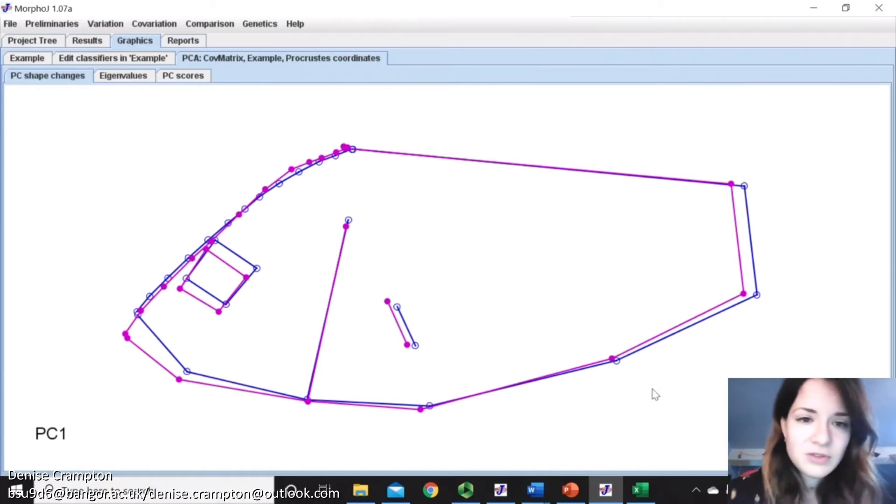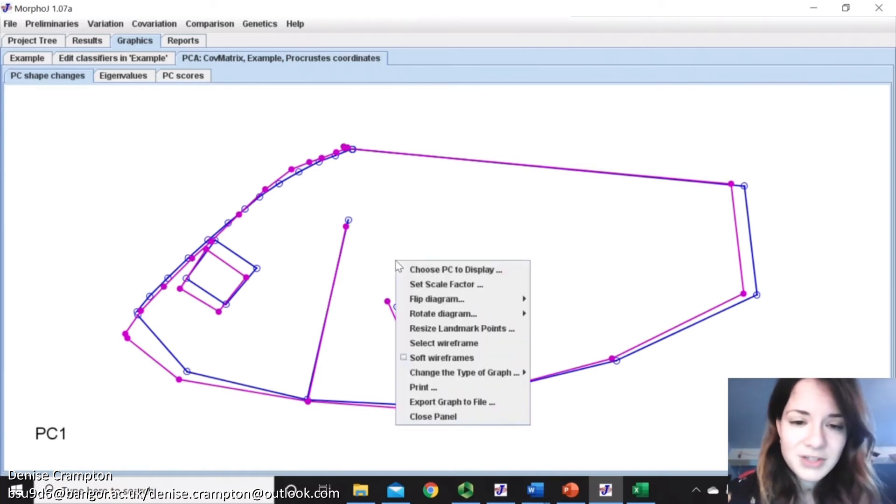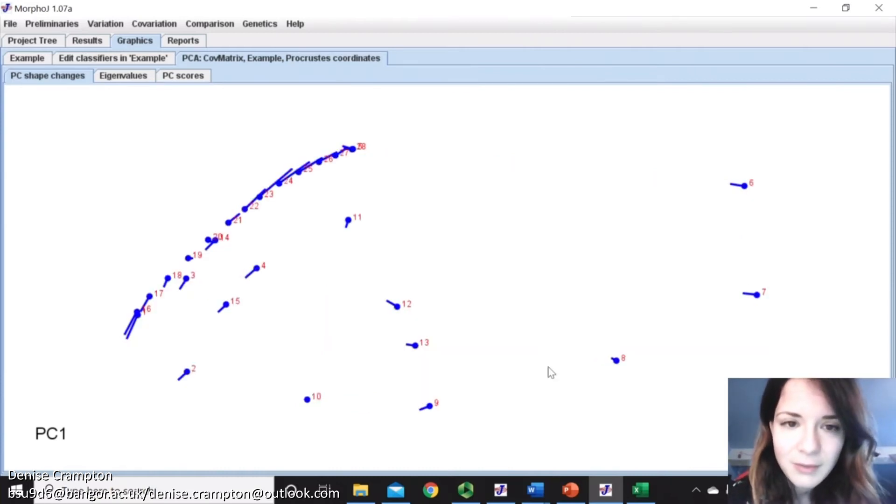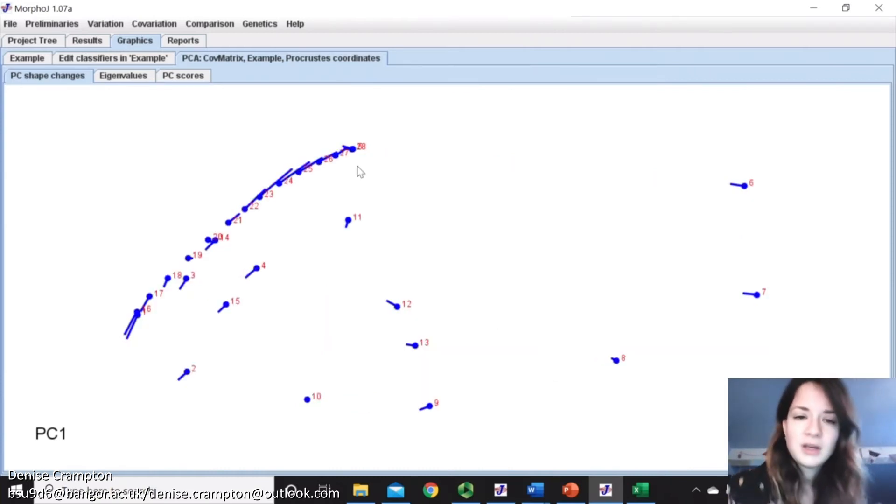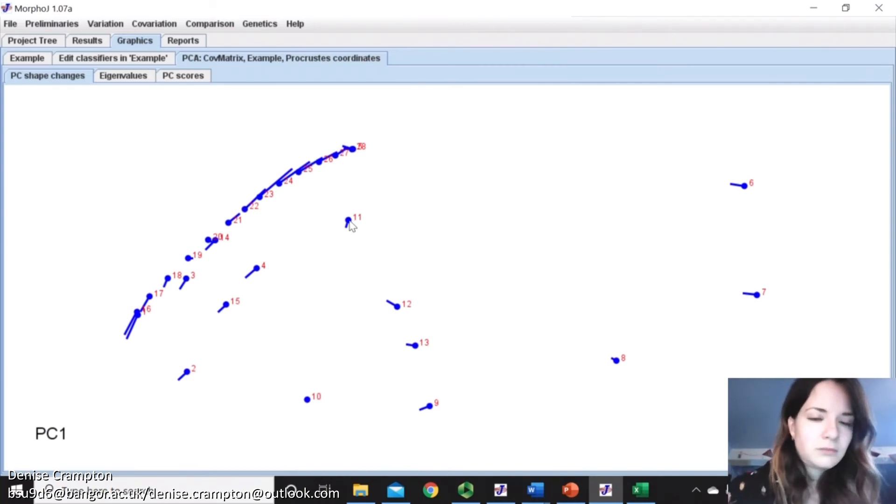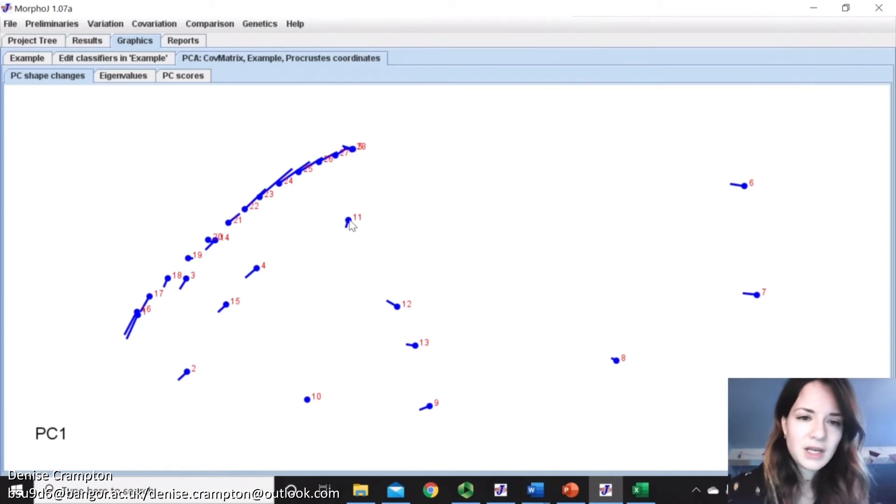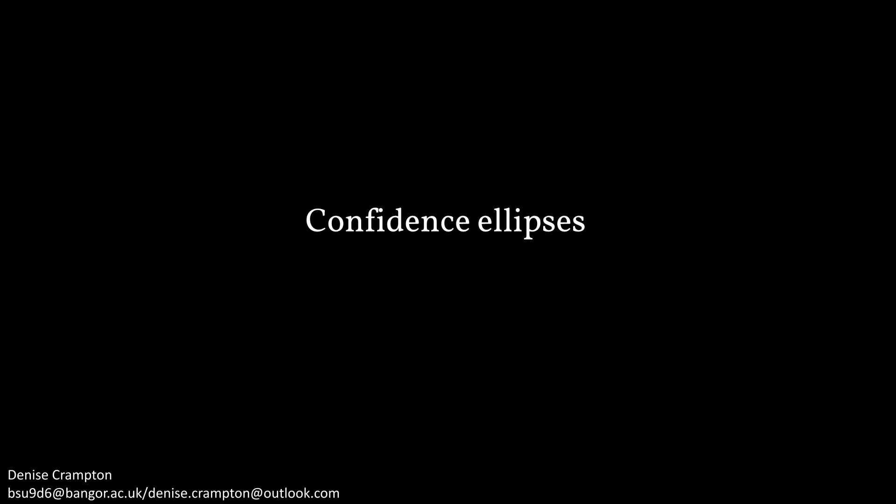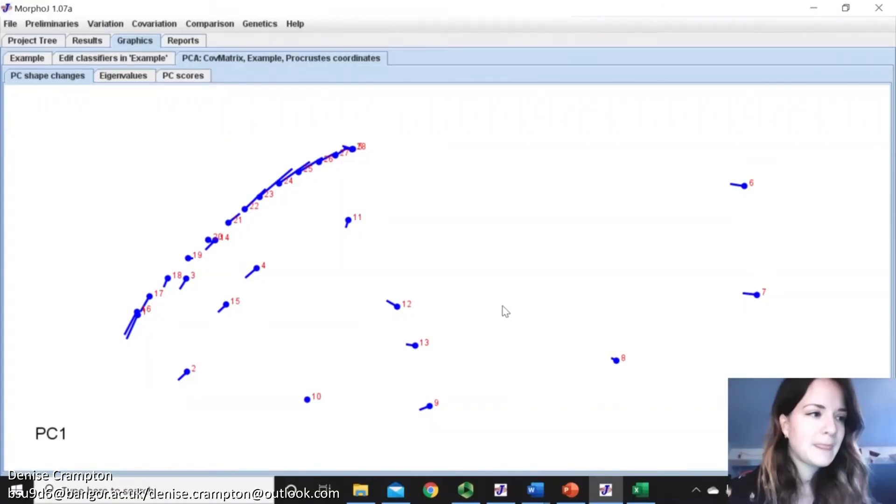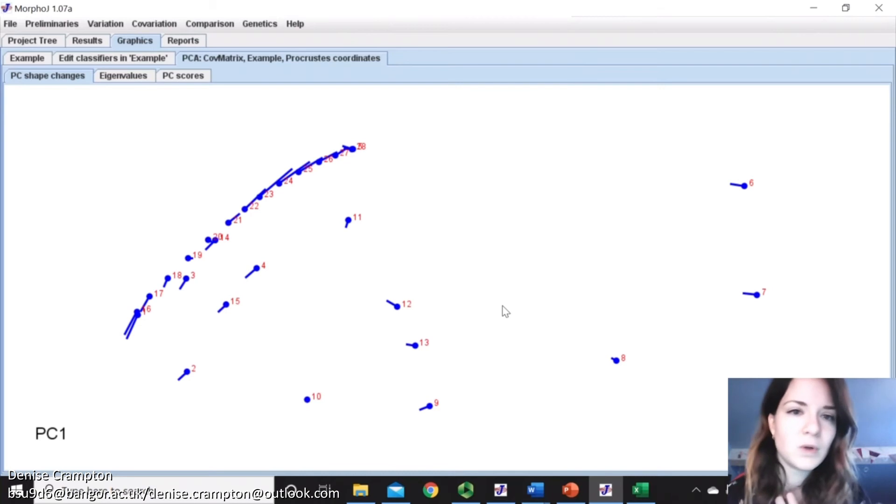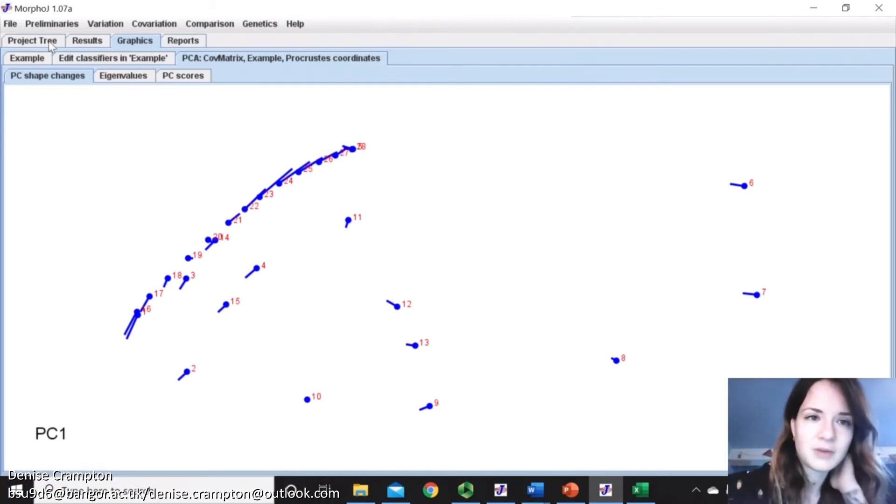Also, just to show what this actually shows. If I just go back to the lollipop graph, the dot shows the mean shape, and then the line shows basically the shape variation.